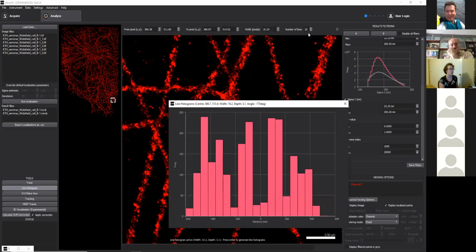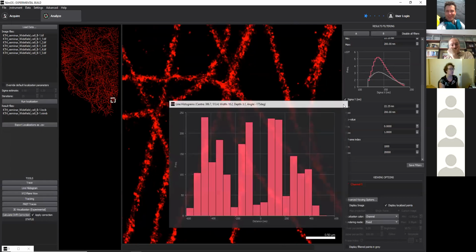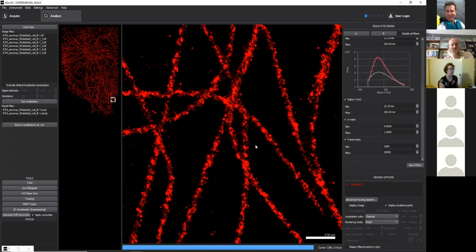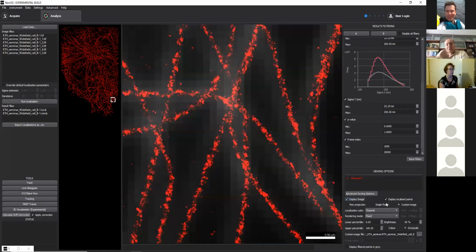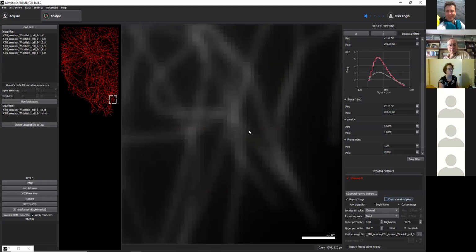And we can again see all 4 of them. Actually, it's a little bit hard to tell because there aren't enough bins in this graph, so we can actually do this. And we can now see the spacing between all of those microtubules. And again, we can compare it to that wide field image and see that with the wide field, we really are losing all of that information.